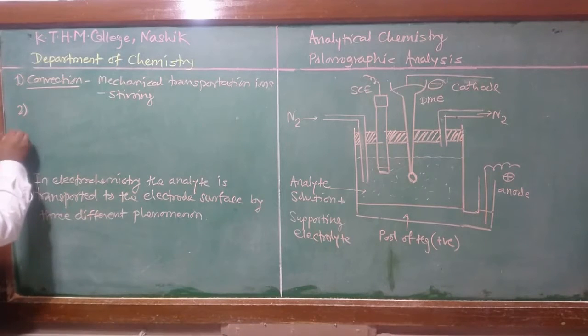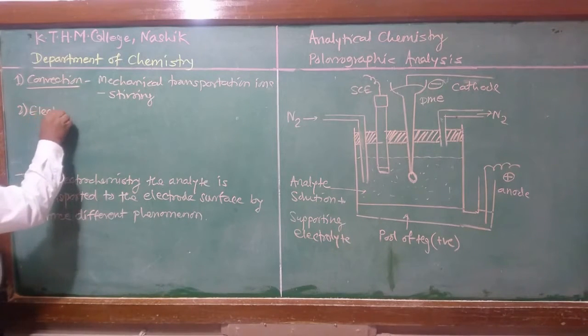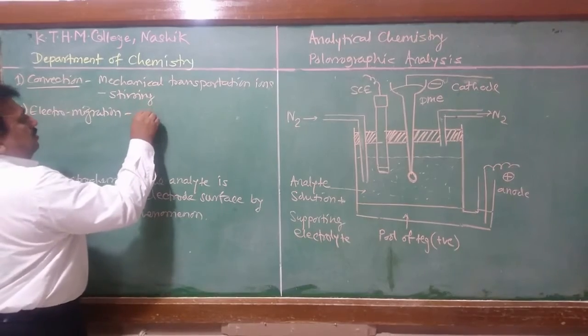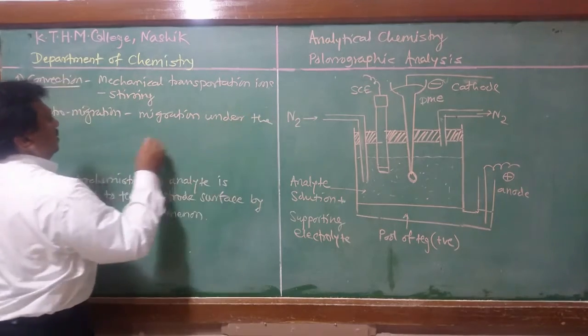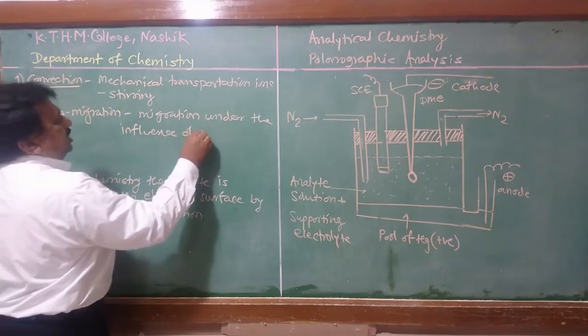The second phenomenon is called electromigration. Electromigration is migration under the influence of an electric field.